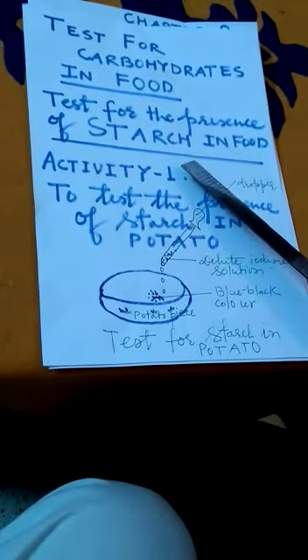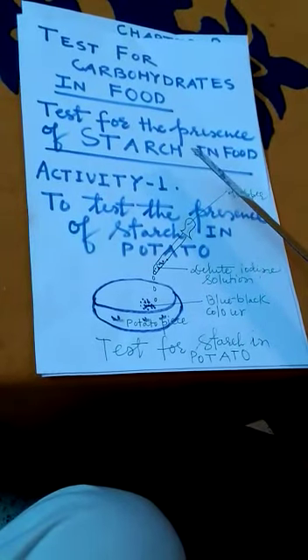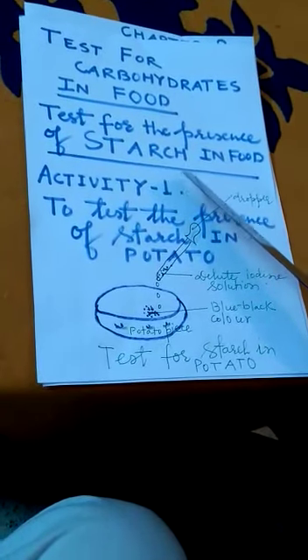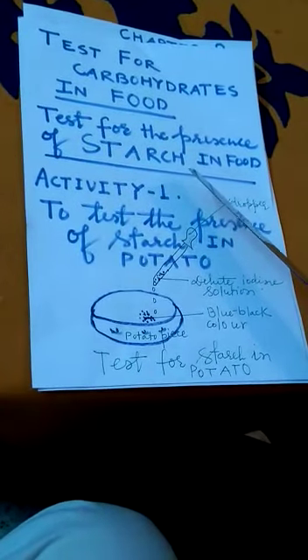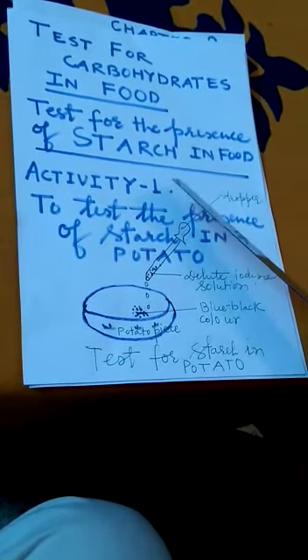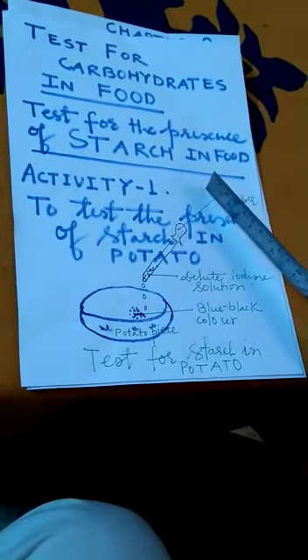The test is based on the fact that iodine produces a blue-black color on combination with starch. So, a food item which gives a blue-black color on adding a few drops of dilute iodine solution will contain starch. On the other hand, a food item which does not produce a blue-black color on adding dilute iodine solution will not contain starch.